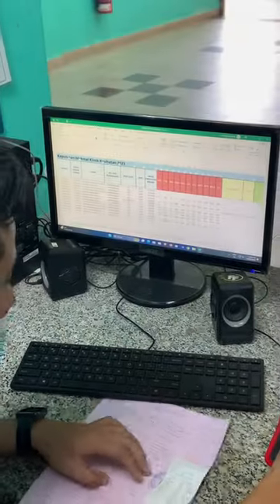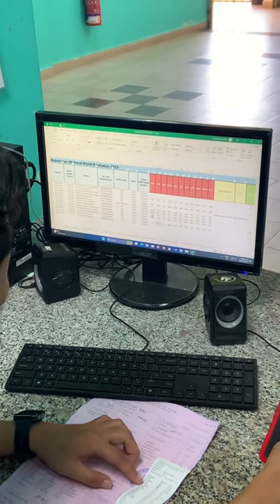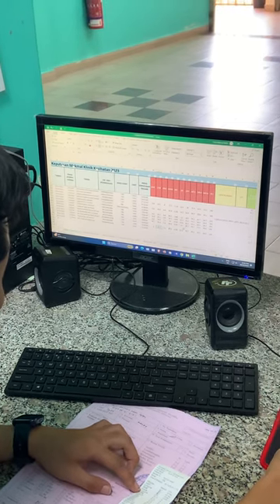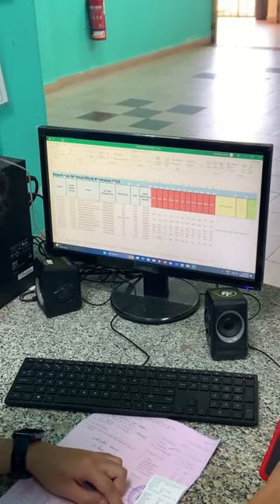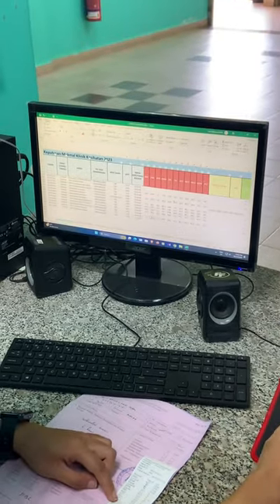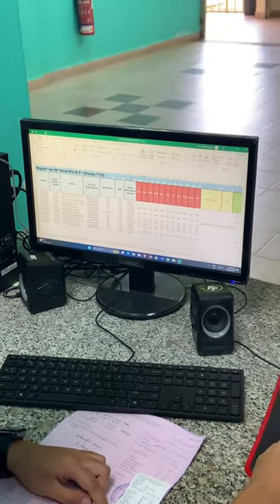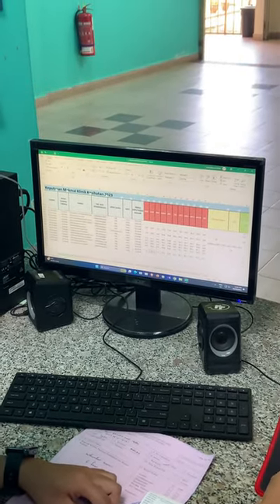Setelah uji kaji berlaku terhadap sample — after testing is done on the sample — the result or data that we have will be entered into the computer for the next step.